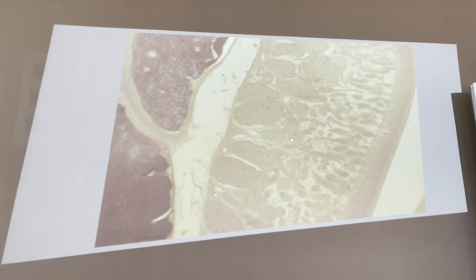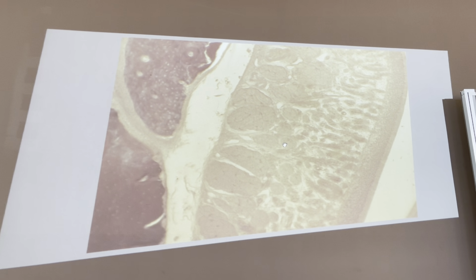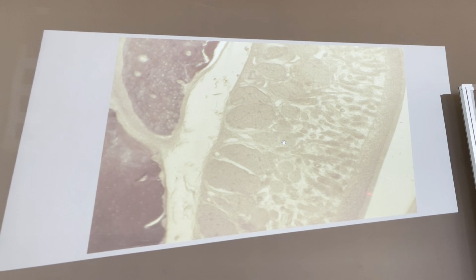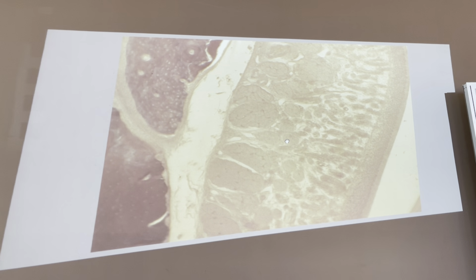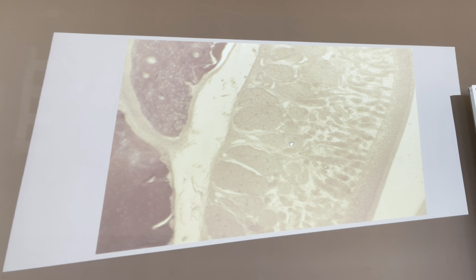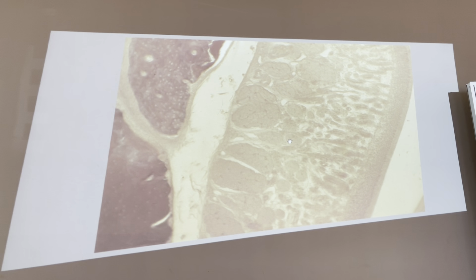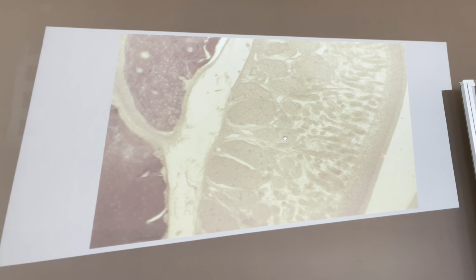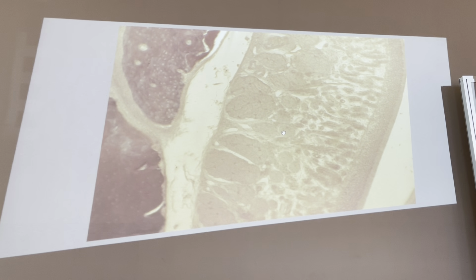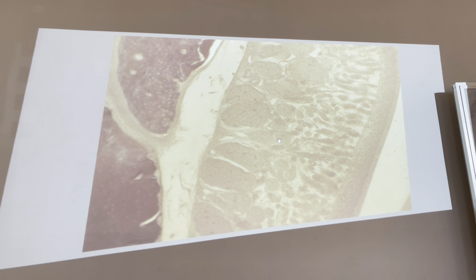So this is the basal cell layer. From this point to this, all of these are the olfactory cells, which are bipolar neural cells. From the apical surface, what do we have? We have cilia, which we call olfactory cilia or olfactory hair, acting as receptors for the reception of odors. These layers, which are near the apical surface, are the supporting cells, supporting the adjacent olfactory cells. That's all about the epithelial cells.